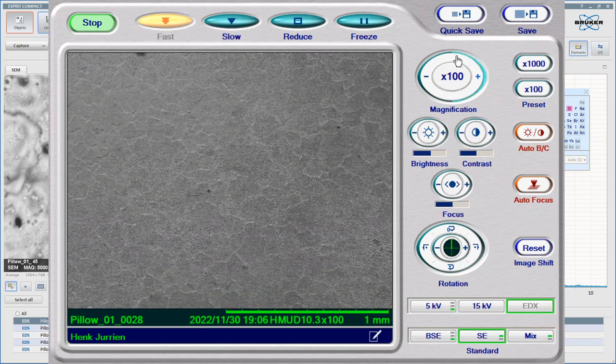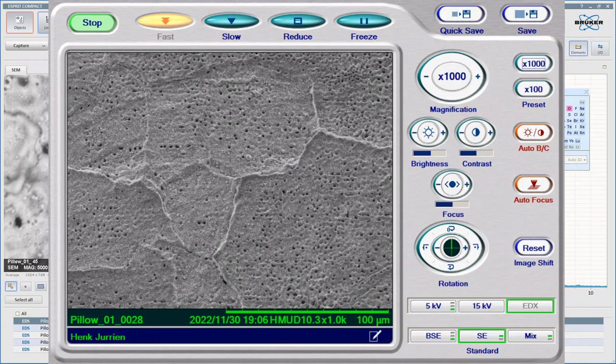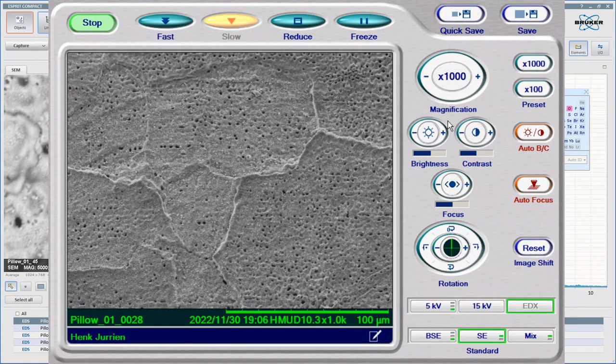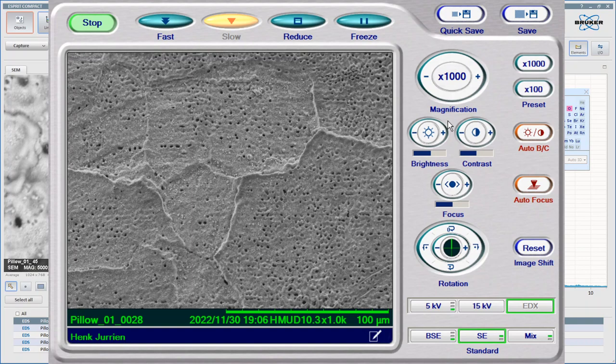But if we zoom into these, you will see there's the kind of cells, these potentially crystal grain areas. But you'll see that there are these holes in here, fairly regular looking holes, and they are all over the surface of this thing. Now, if they go all the way through, you'll wonder how any sort of pressure was able to be maintained when this thing inflated. What is coming out of these holes? That is something that is worth asking.